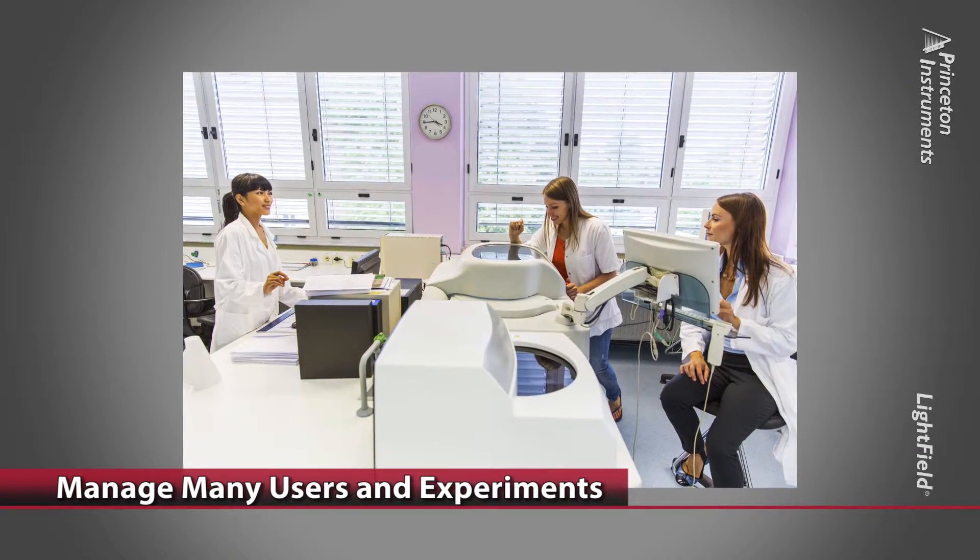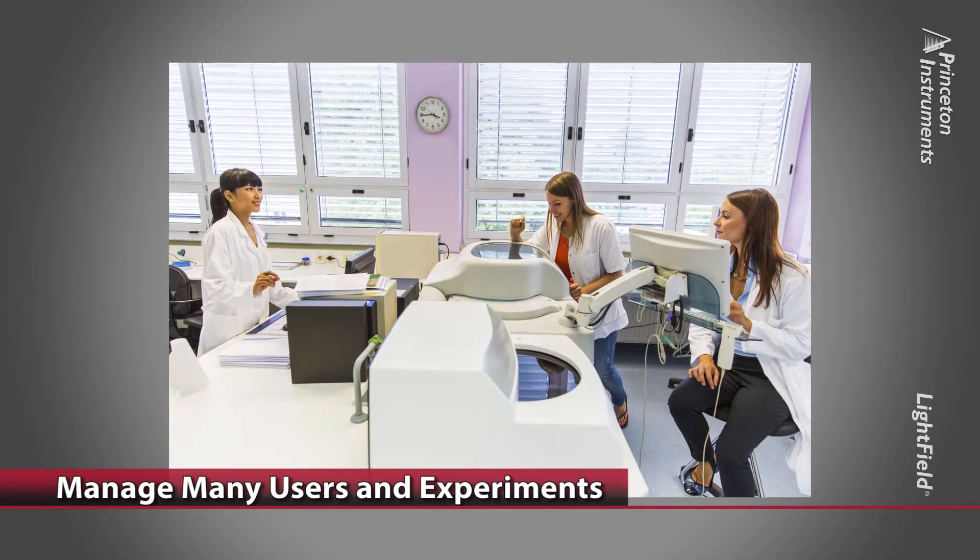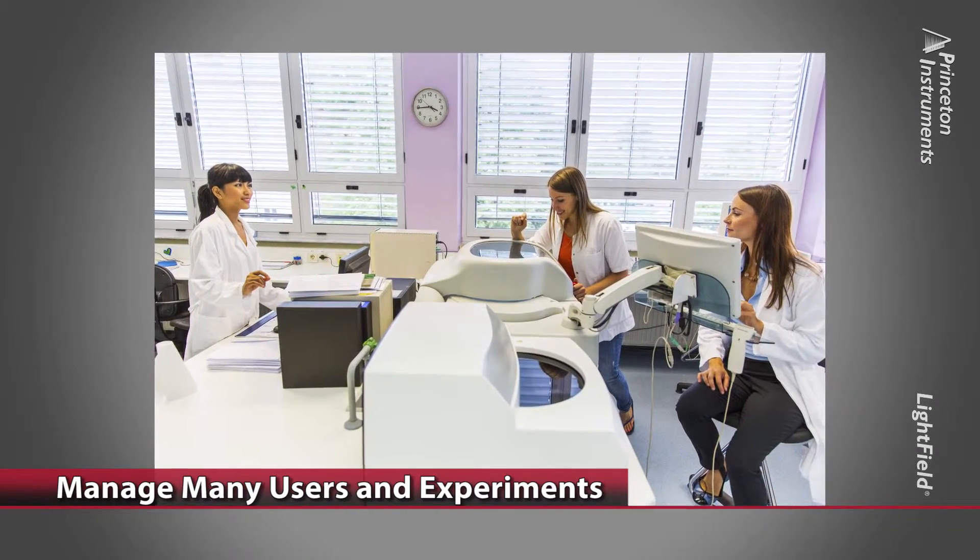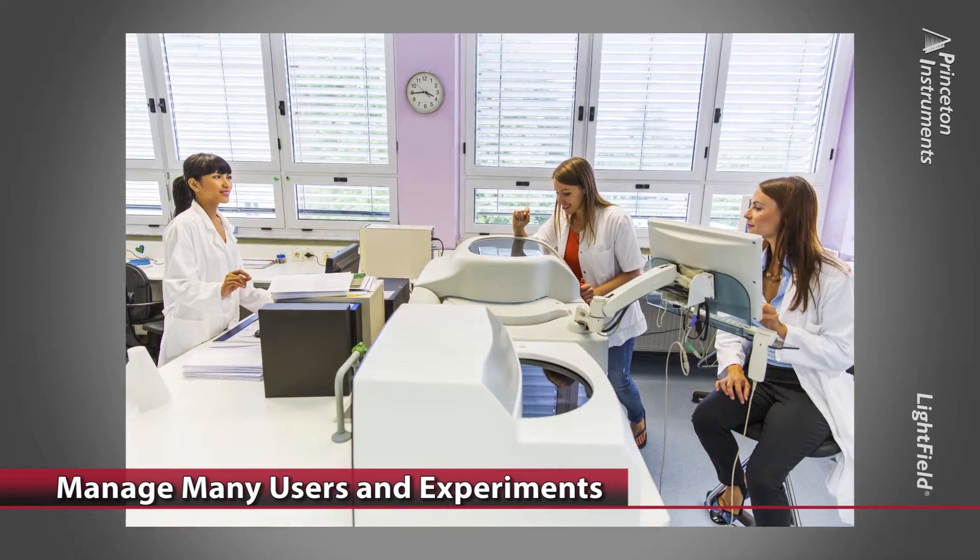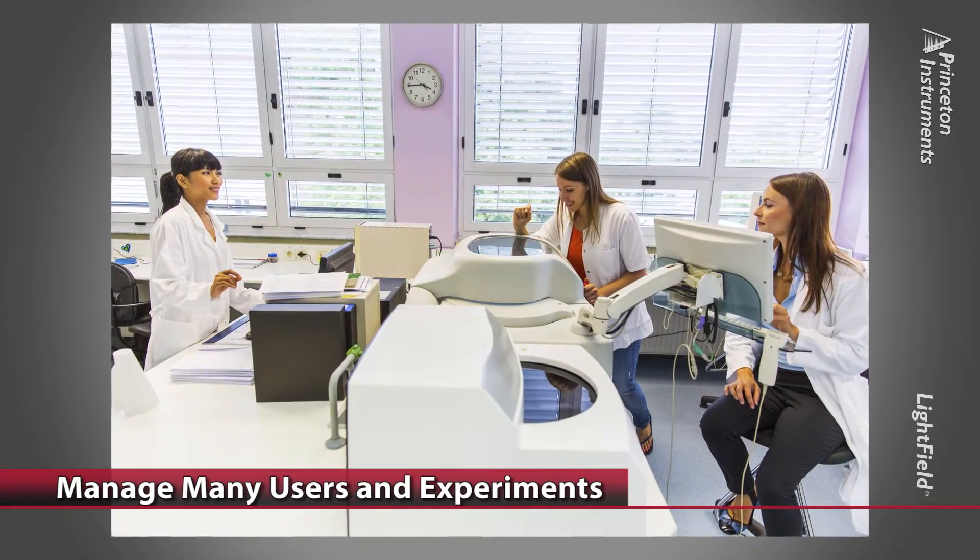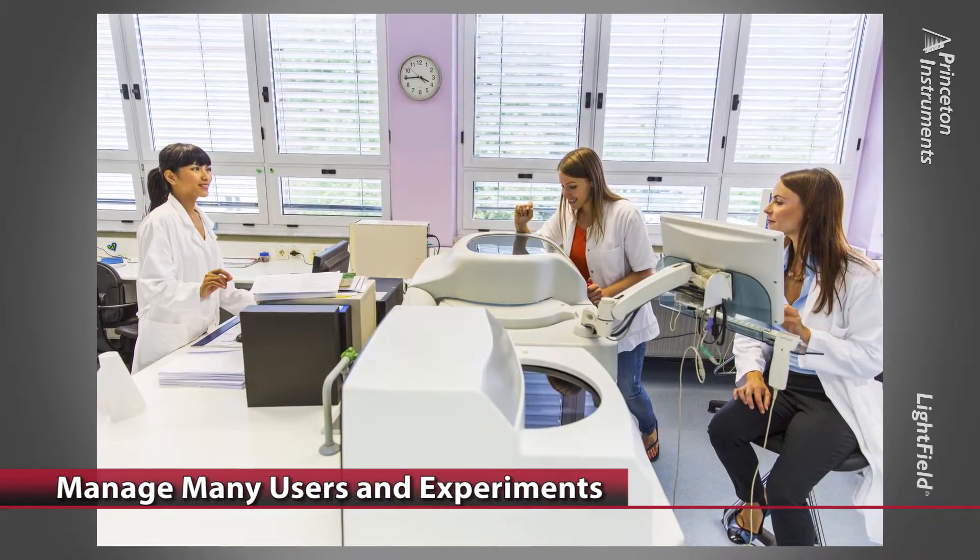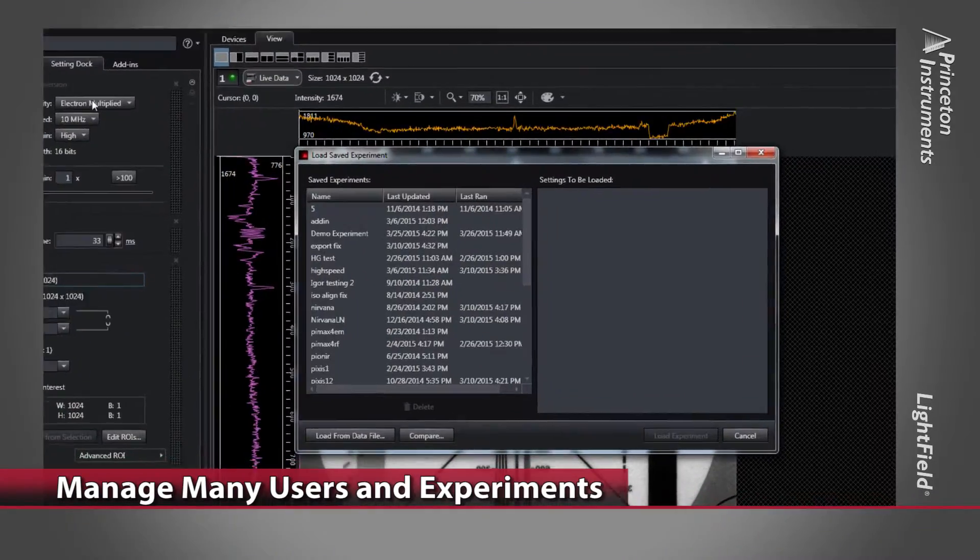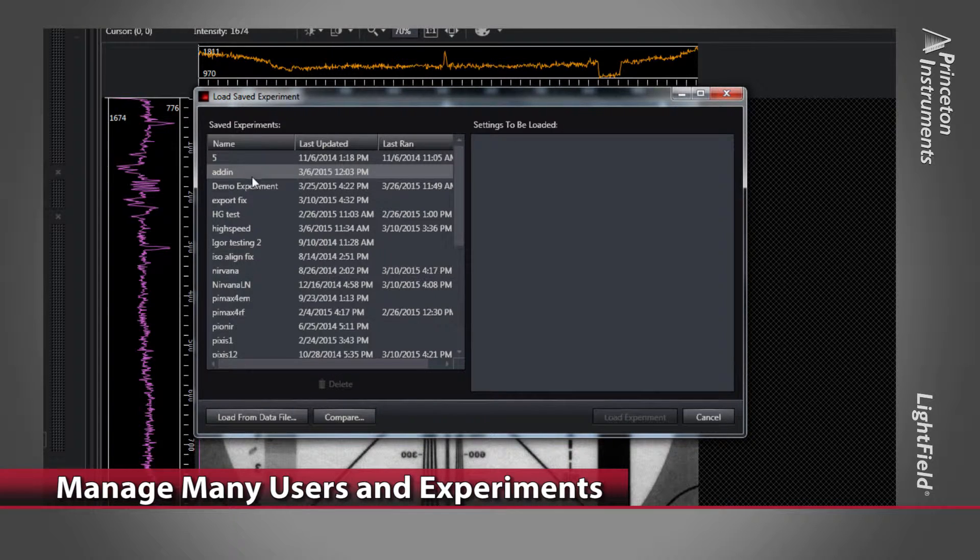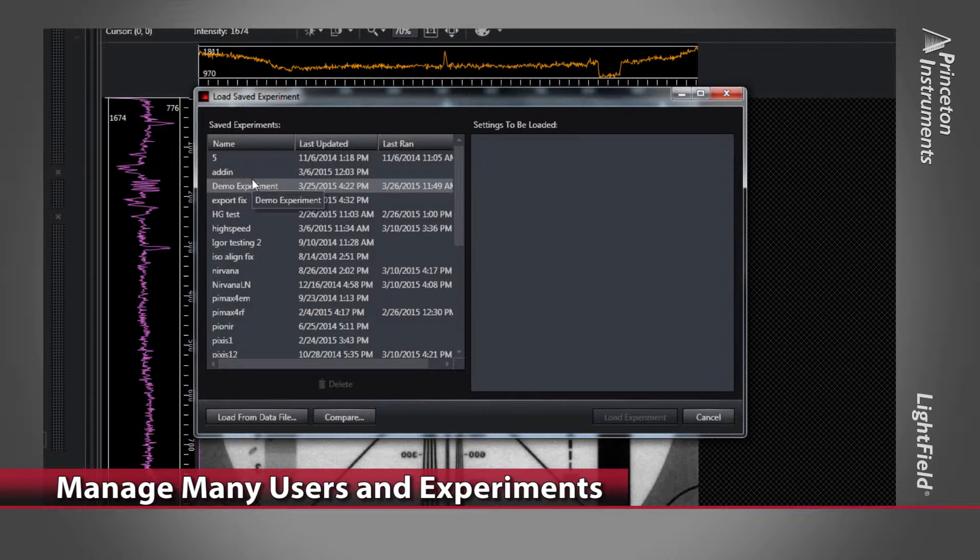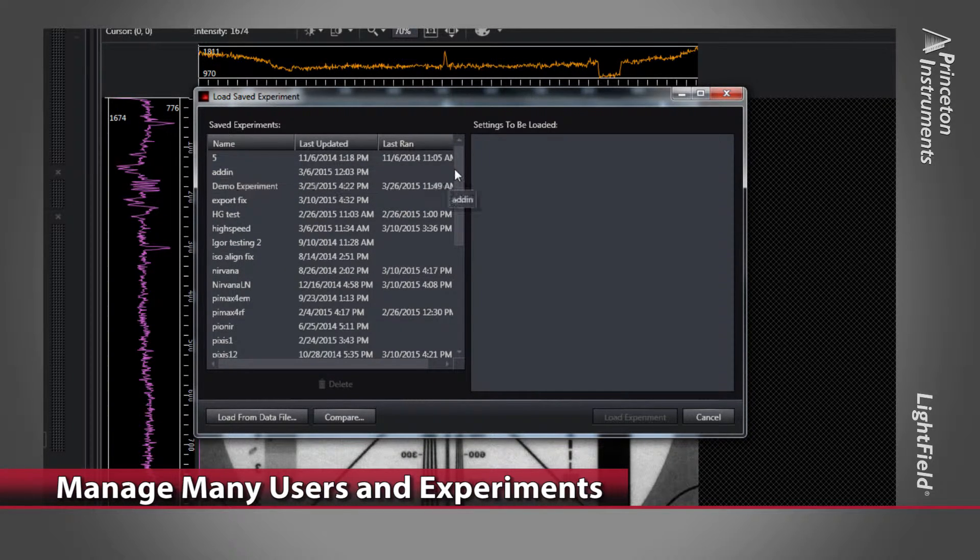A typical lab has multiple users, and each one may have multiple experimental setups based on the same hardware components. Lightfield software makes it easy for users to save and recall their own experiments, including all calibrations.